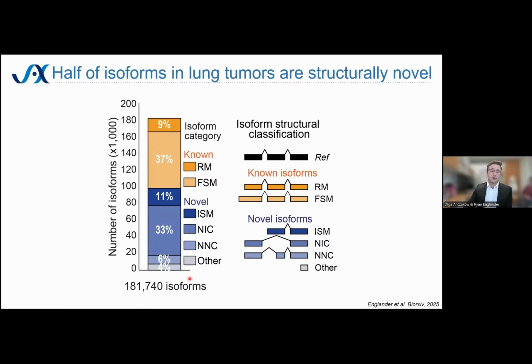We did this in fall of 2022. So we identified over 75% as many isoforms as in the entire human reference transcriptome, which pulls from tissues from across the body. And that took just 12 patient tumor samples in 1 month of a PhD student's time to assemble a transcriptome that large.